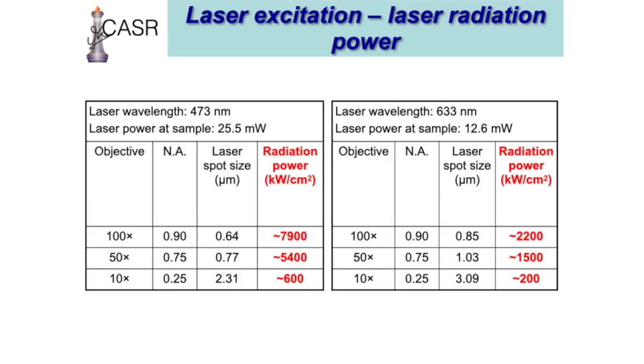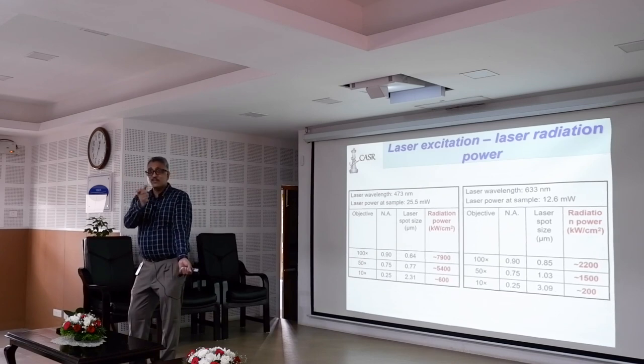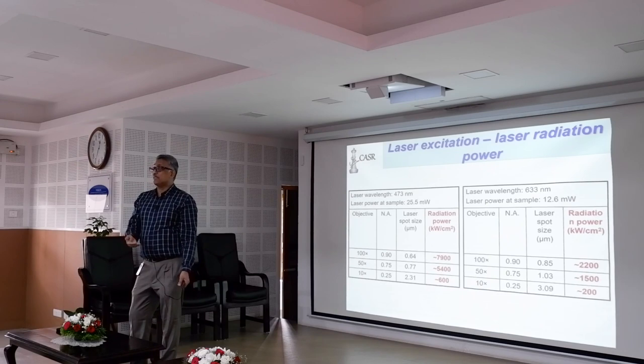Another problem with laser is that it burns the sample. You know that in your childhood you would have done this: you have a lens, you take the sun and put it onto your skin, it burns, right? But the sun directly doesn't burn your skin, right? What are you doing? You are focusing the light, right? So whenever you focus the light, you are making all the intensity of light fall on a smaller area. So that is the problem. Your samples can get burned.